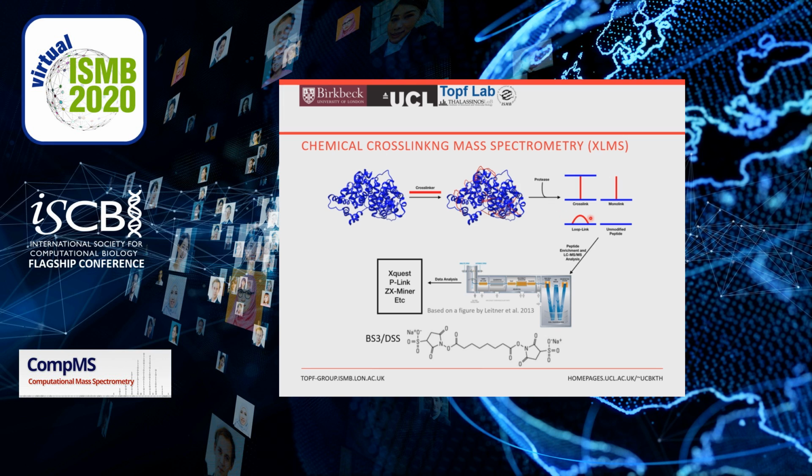And when we digest the protein, that will yield four different types of molecules. We have our crosslinks, which are the most information-rich type of molecule, giving us residue exposure information for two residues, as well as distance information between the two. We have our loop links, which are similar, but both residues are linked together on the same peptide, so this distance information is slightly less useful.